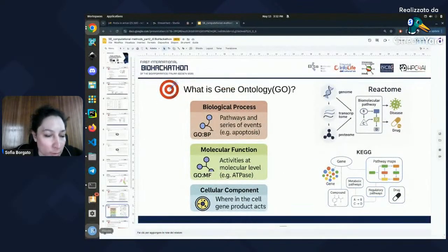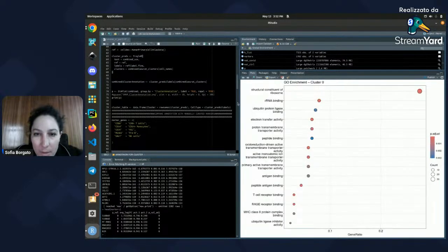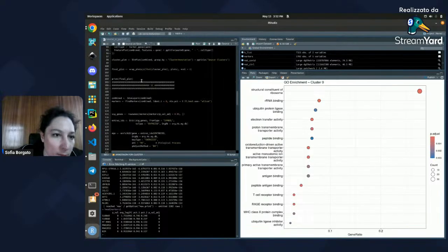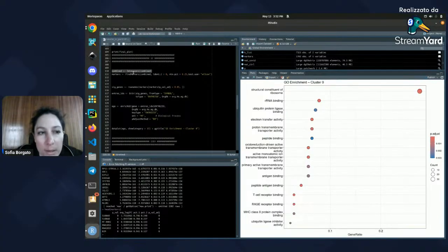Okay, let's move on to the code. So we have this cluster. Let's go on with the plots. So we mainly have our data that I called combined, because I took two samples from the entire dataset at the beginning. I took just some examples and I combined them.